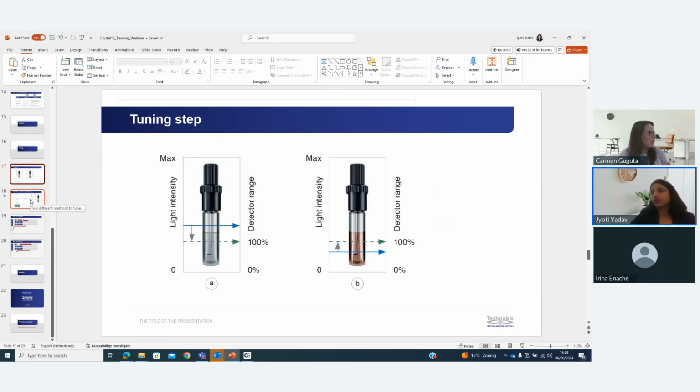Then you can use a concentration 0.5 times of that, and you can go 2 times and 4 times of that concentration, and then you can program your thermal cycles. In this way, you have four vials with different concentrations.